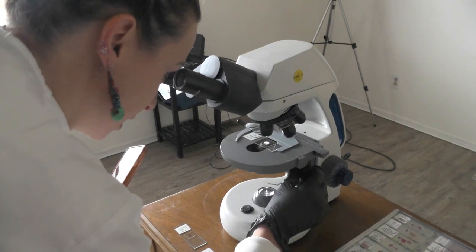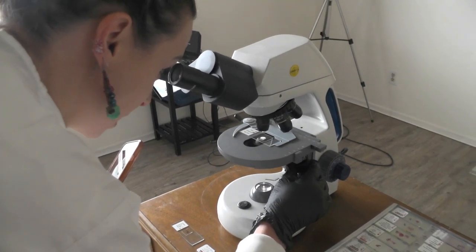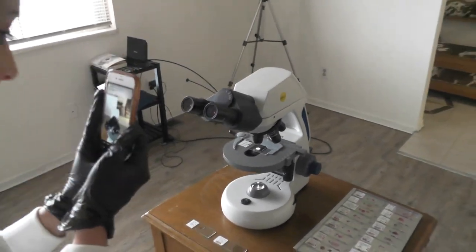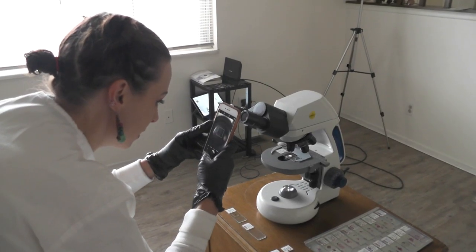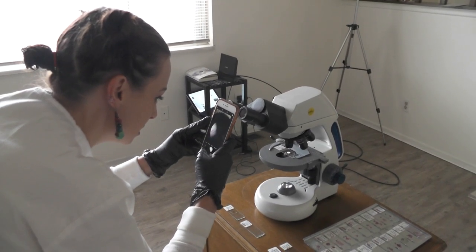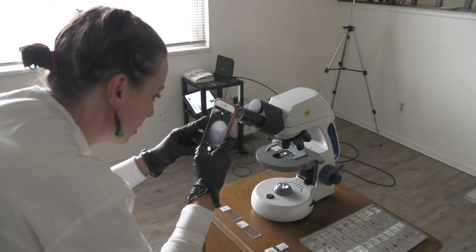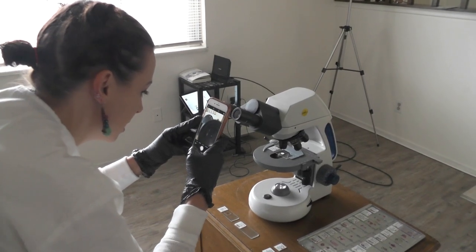I don't see the adventitia here. I guess this one side has a little bit, but it's really cool because from this far away, we can see a whole lot. The layer that I have it in right now looks like it's the muscularis mucosae. All right, let's move on.